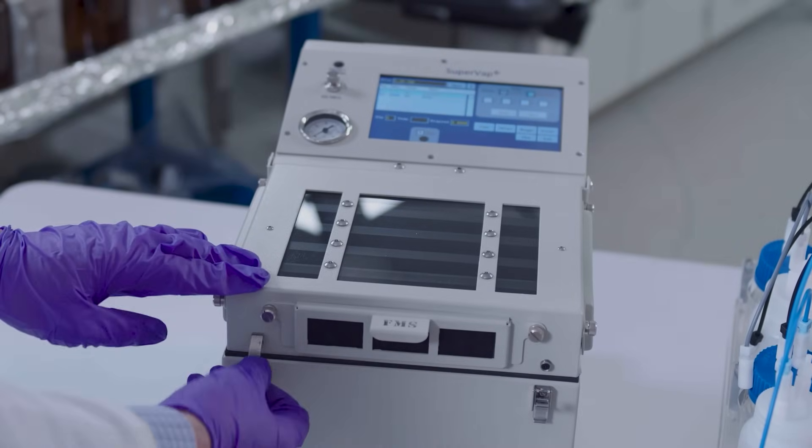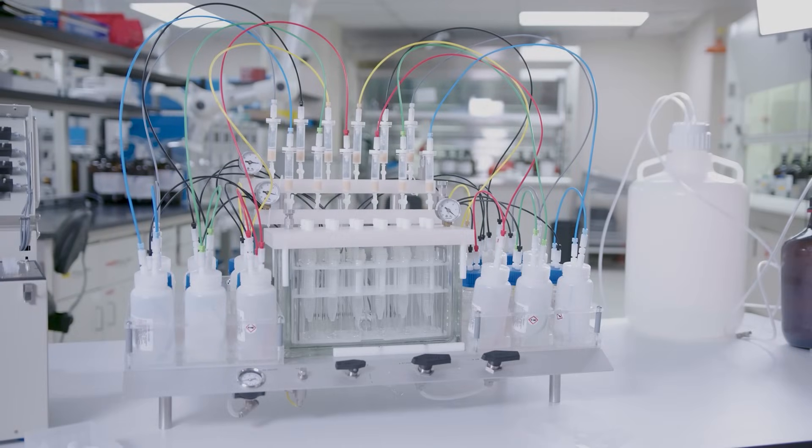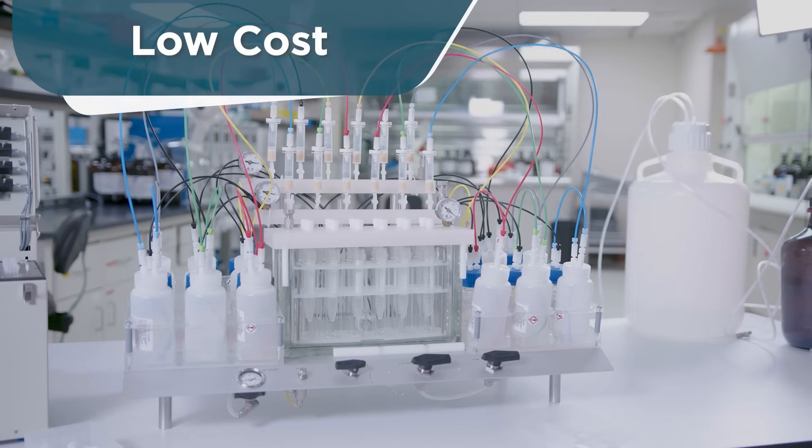Complete water sample prep workflow for the analysis of PFAS. Low cost, high throughput, low maintenance solution. Self-installable.